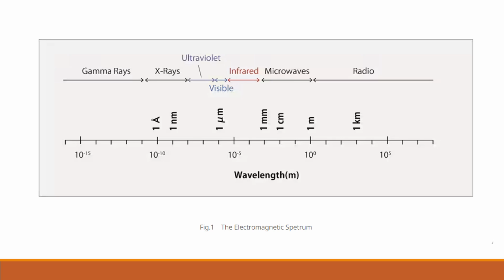Now coming to your first detector, that is the absorbance detector. It could be a DAD detector, it could be a PDA detector. Absorbance detection is the most common detection in HPLC analysis. Light is a type of electromagnetic wave, and these waves are given different names depending on the wavelength.